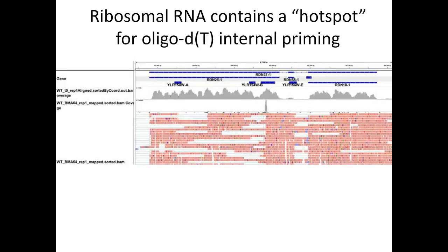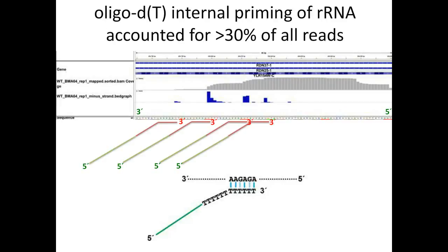So if we zoom in on this hotspot, we can see that the Oligo-dT was likely priming at these short stretches of imperfect A's that typically had a G or two in the middle. And so from looking at the types of mispriming that we were getting from this abundant RNA, we're able to determine that Oligo-dT can efficiently prime, under the conditions of our library prep, an imperfect stretch of 6 A's that can be interrupted with up to 2 G's. And the GT base pair is a wobble pair, and that explained why we were getting some of these contaminant reads.